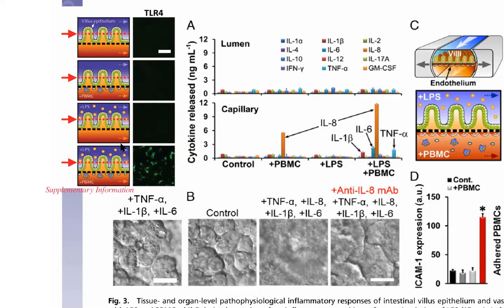They also did another marker called TLR4. It stands for toll-like receptor 4, which is known to drive the cytokine production. So they all took pictures at this level, this red line level. We can see the TLR4 is expressed on the surface of the epithelial cells. So combined with the qPCR result, we can say that it's actually the epithelial cell that secretes these cytokines.